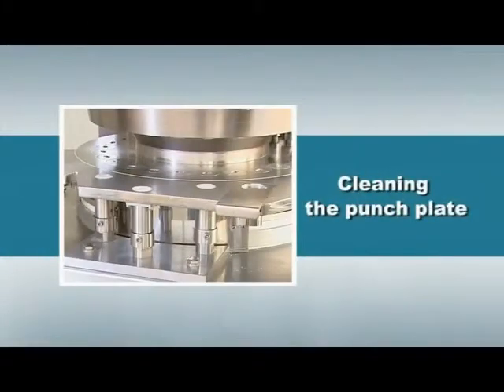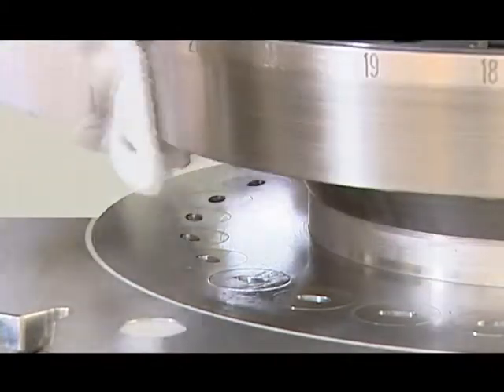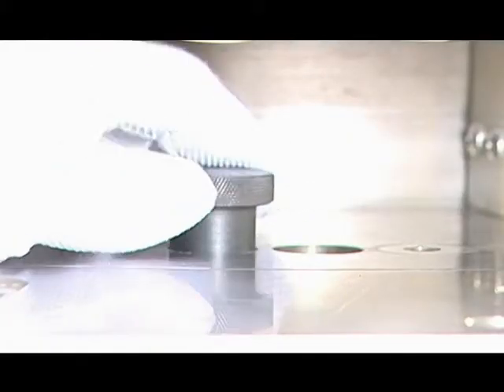Cleaning the punch plate. After unloading the module, the upper and lower punch plate cover should be cleaned. Upper and lower punch plate module holes should be cleaned by brush. Middle punch plate module hole should be cleaned by scouring pad.